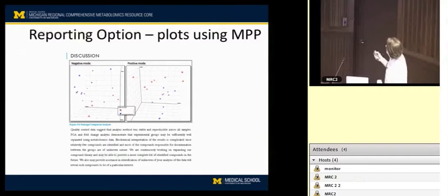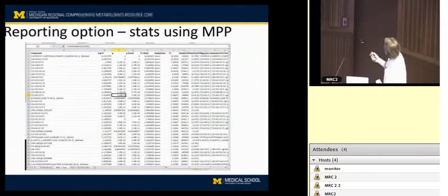A very early and useful tool might be a PCA plot, which you've heard a little bit about so far in this workshop. Essentially, when I have just a few groups, two or more, how well do they separate from each other? Are there definitely metabolites that delineate these groups from each other? That's a quick way of seeing that yes, there's a signal there that's different between these two groups.